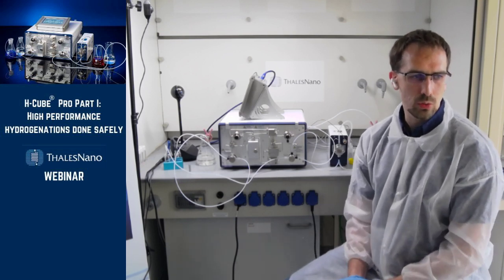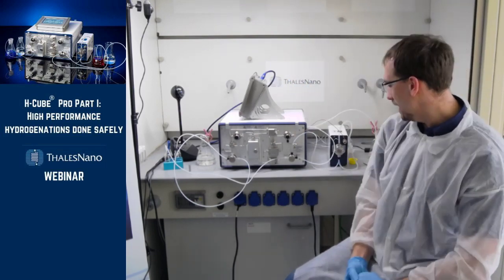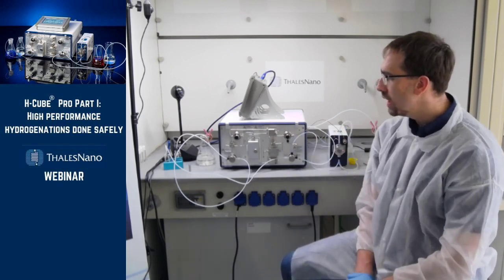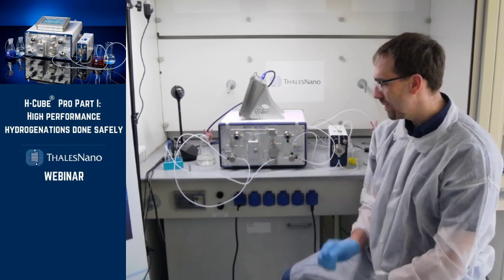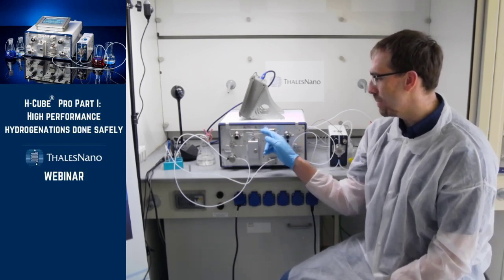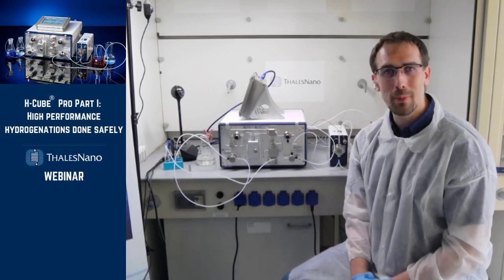What precautions should chemists take for a longer life time of the system? Keep the water always clean. After a run, make sure that you always clean the reaction line with clean solvent, so just flush it through for some time. Be gentle with the screws if you are opening them. Some people tend to have really strong hands, and generally these screws don't need to be too strongly tightened, so most of them are kind of finger tight or a bit stronger than that. I would say these would be my general advices.